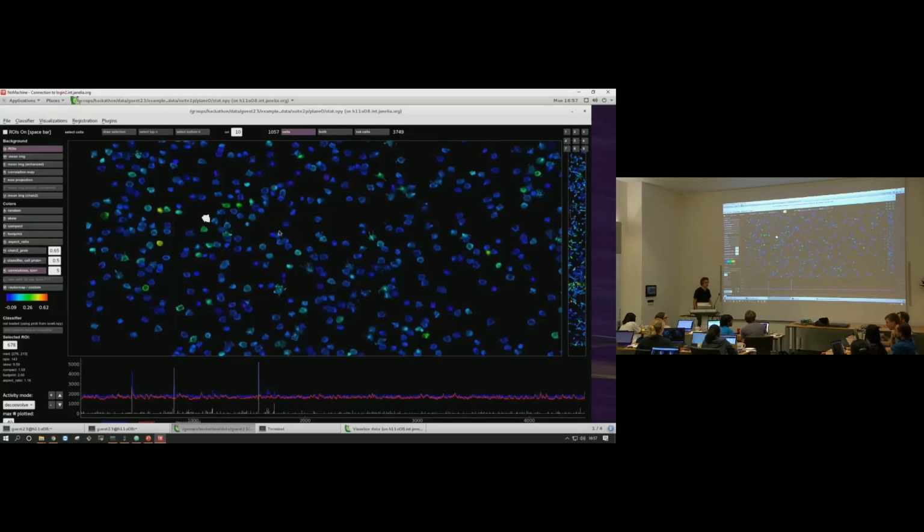How much would the deconvolved data change if I use different calcium sensors? There's one parameter you have to set yourself, which is the time scale. We've tried it on fast and slow and medium, and if you set the time scale right, and by right, again, I mean within the order of magnitude, right? You can't be too wrong, but you get better answers. You get a better estimate of the ground truth spiking. Well, first of all, if you do deconvolution at all, and if you do it with roughly the right time scale.